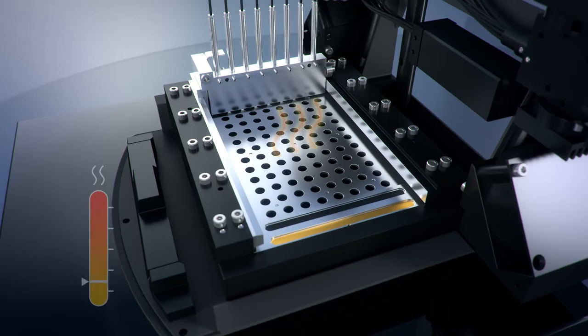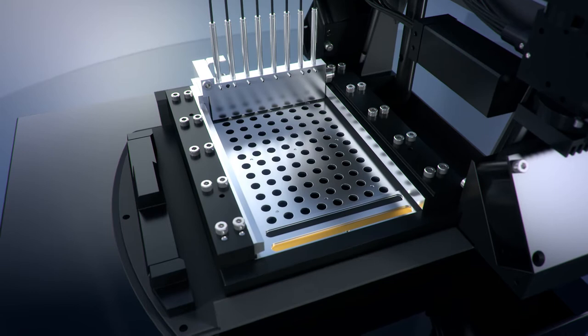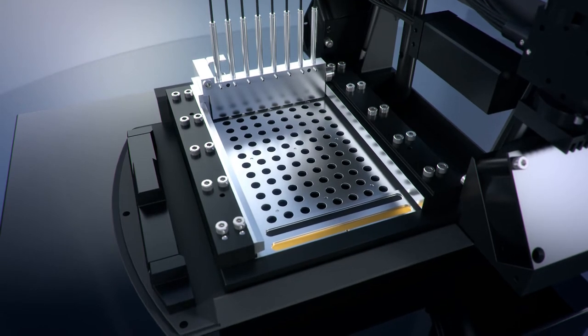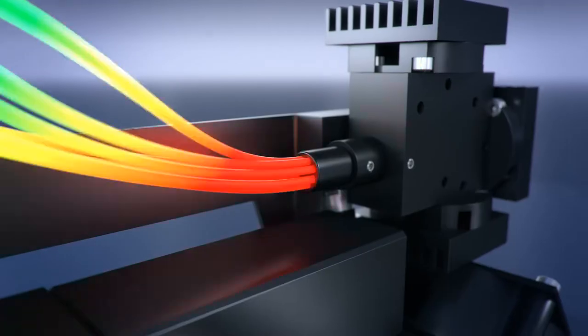To avoid any condensation and sample loss, the system is equipped with a motorized heated lid. Temperatures are adjustable up to 110 degrees Celsius with even contact pressure, guaranteeing optimal performance independent of the consumables used.